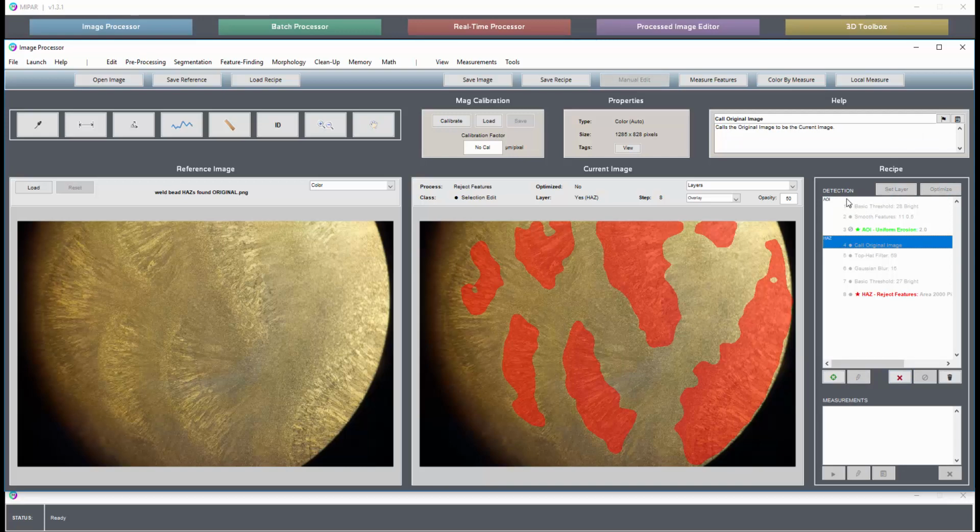So you noticed before we set these layers, the names were start and new chapter. The first step of a recipe is always the beginning of chapter 1, and that always gets the name start by default. Subsequent chapters get the name new chapter. Of course, their names get set based on layers that you might set within, but we can always change these names. So you can right click on a layer step and hit edit chapter, and perhaps you may want to rename this to something else.